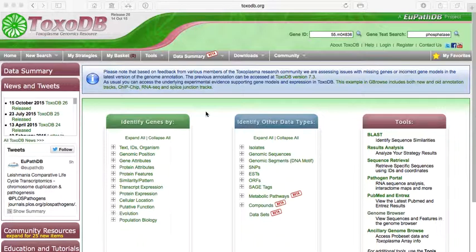And each of these genes has a specific ID. That ID is almost like a zip code or like a street address for a particular house. That will be the same thing for a gene.